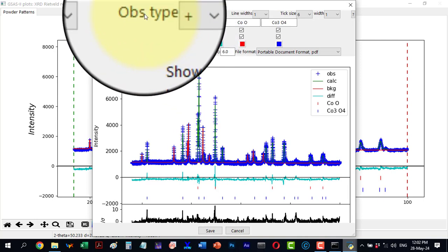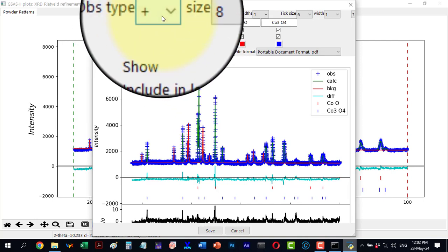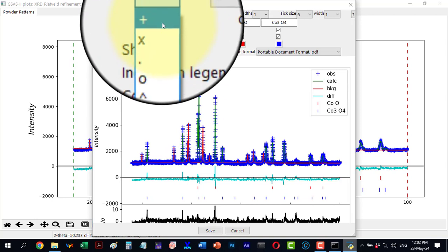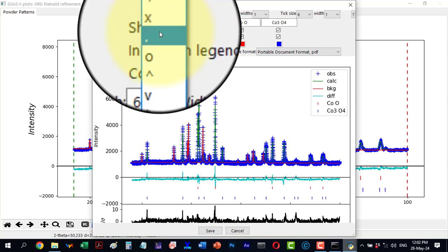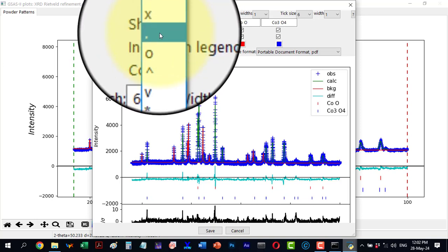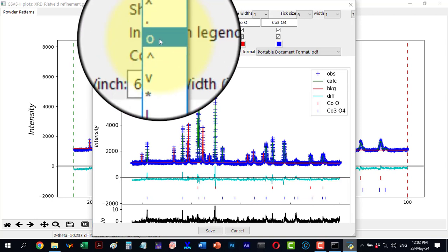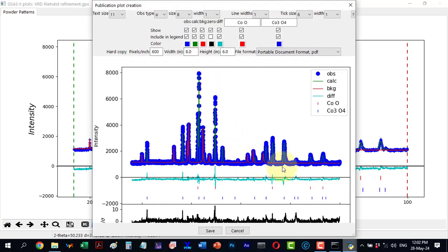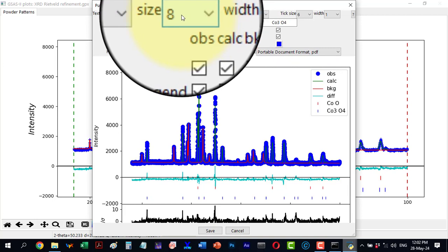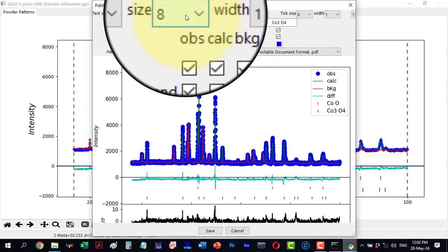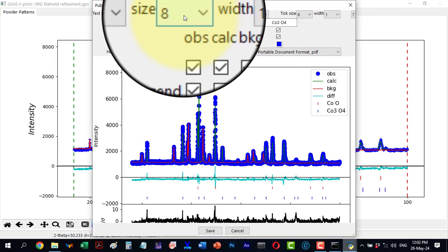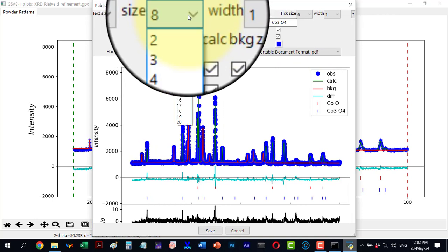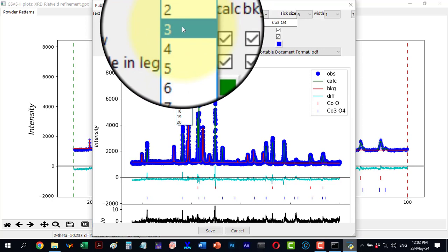Next we have the symbol for the observed parameter represented by a plus sign. This is the observe type. I have different options to select from, and I can see the changes in the observe pattern. The default size is 8, but I can reduce it to 3 and the size decreases.